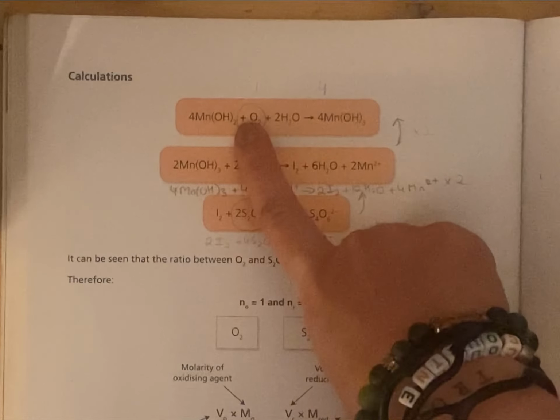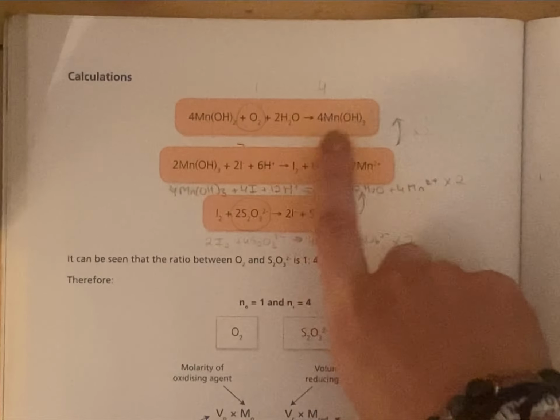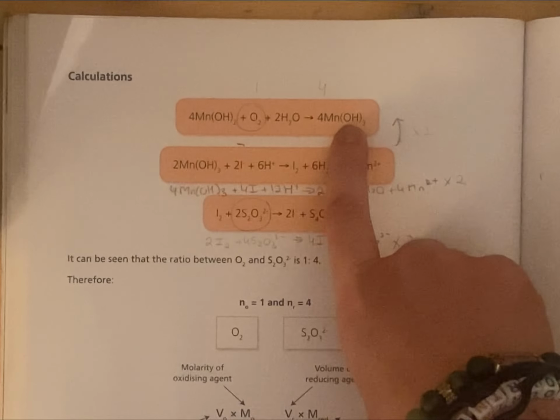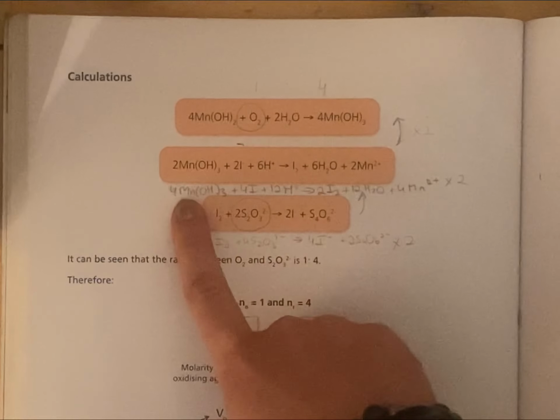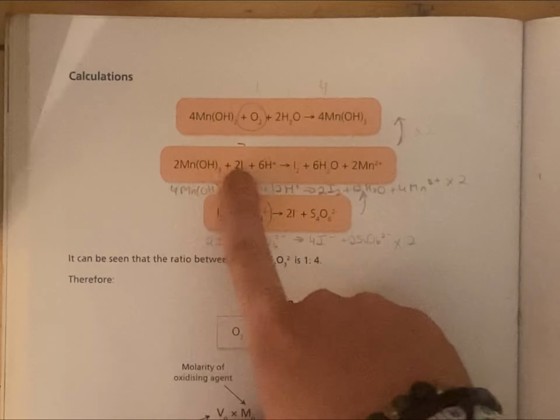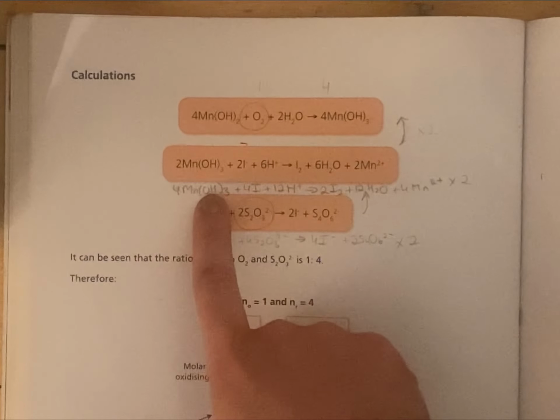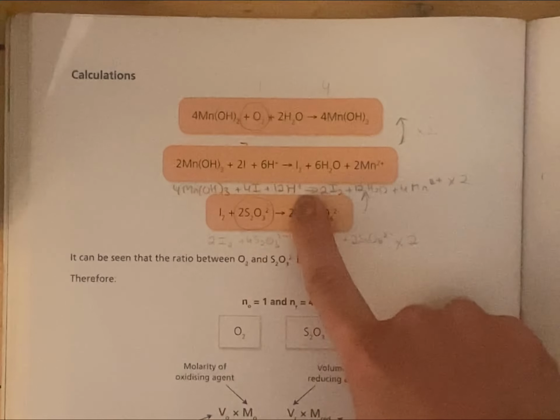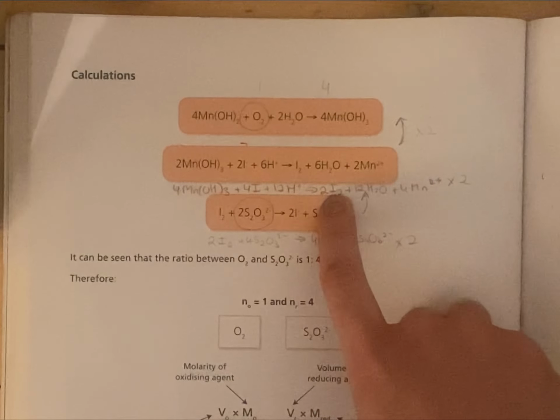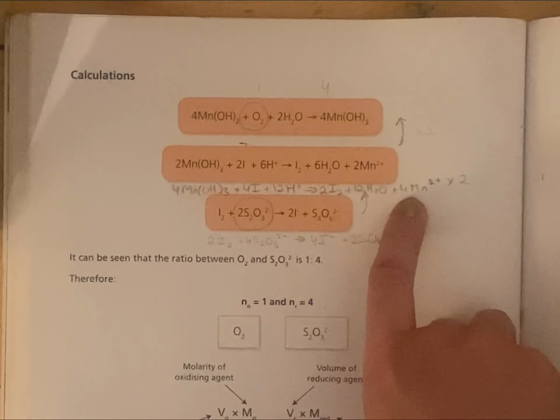Now to get to my oxygen, I need to address this inequality. That's a 4 manganese hydroxide, so I need to make this a 4. Underneath here, I've just multiplied this whole line by 2. So I've got 4 manganese hydroxide, 4 iodine ions, 12 hydrogen ions, 2 iodine, 12 H2O, and 4 manganese.